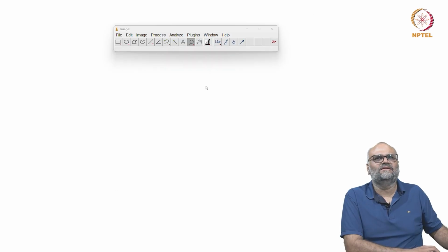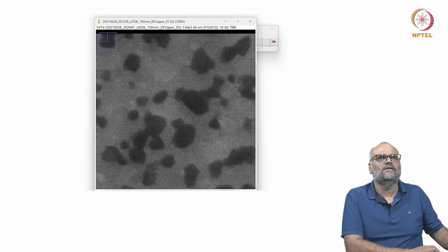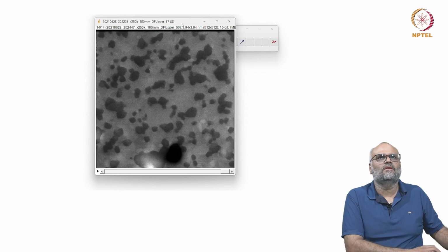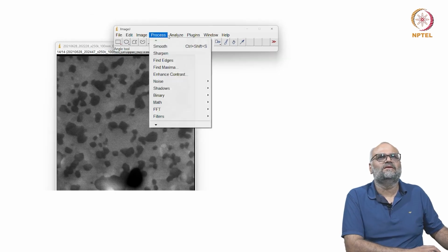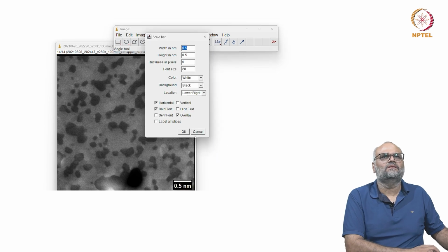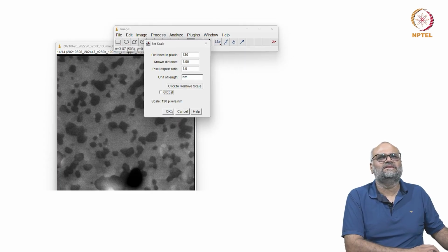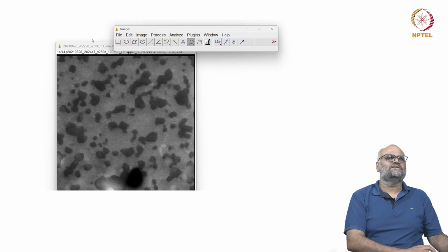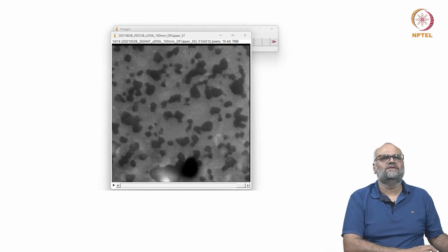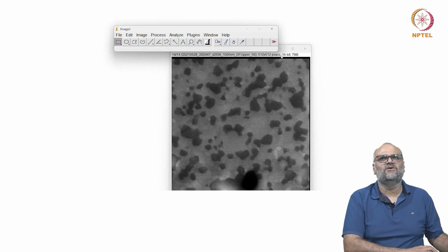And if I crop that frame off, let me remove the scale bar. It still has the previous configuration, so I'm not much worried about the dimensions of this at this moment.